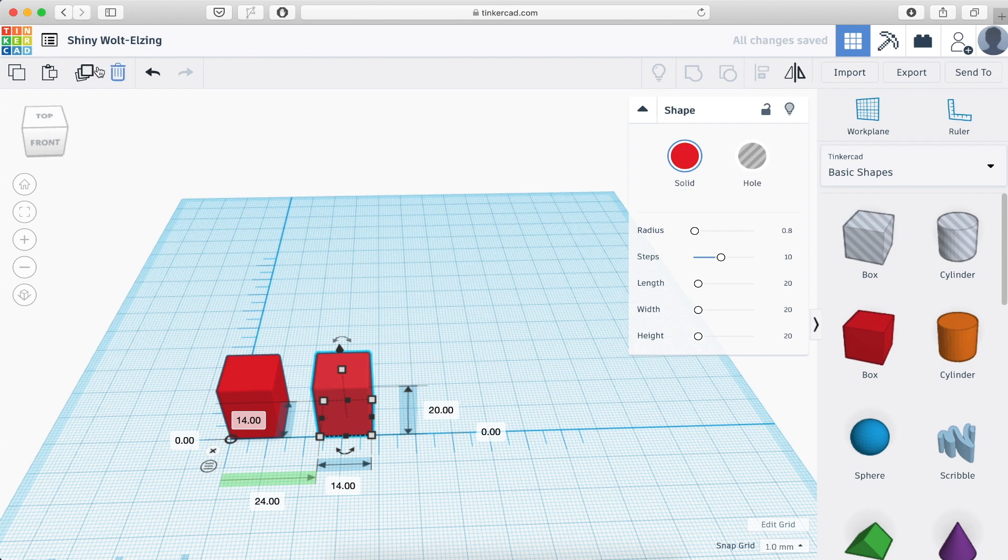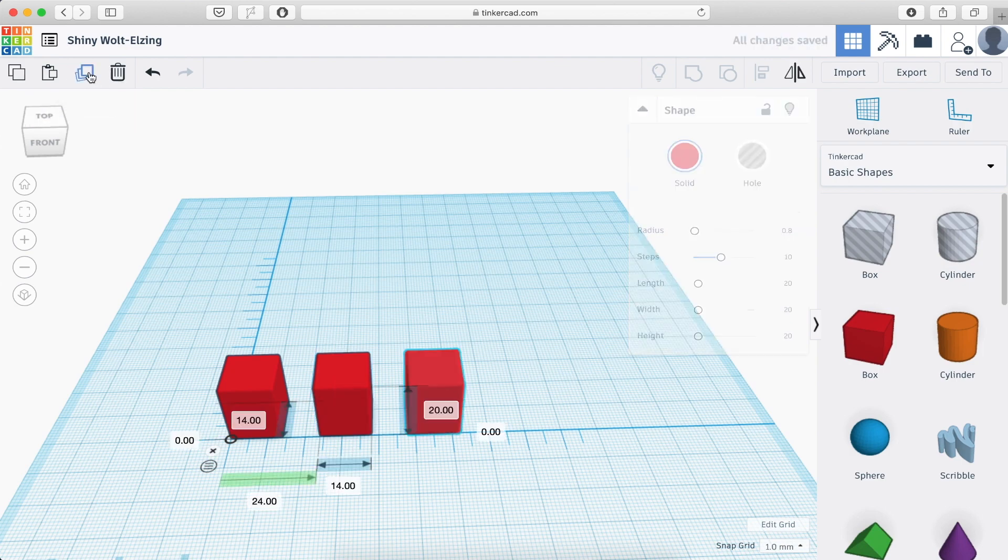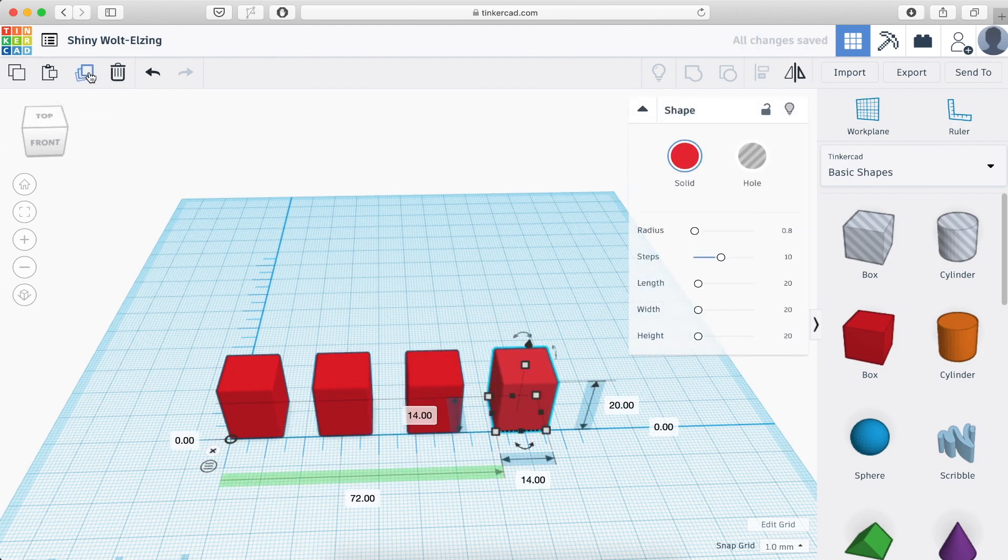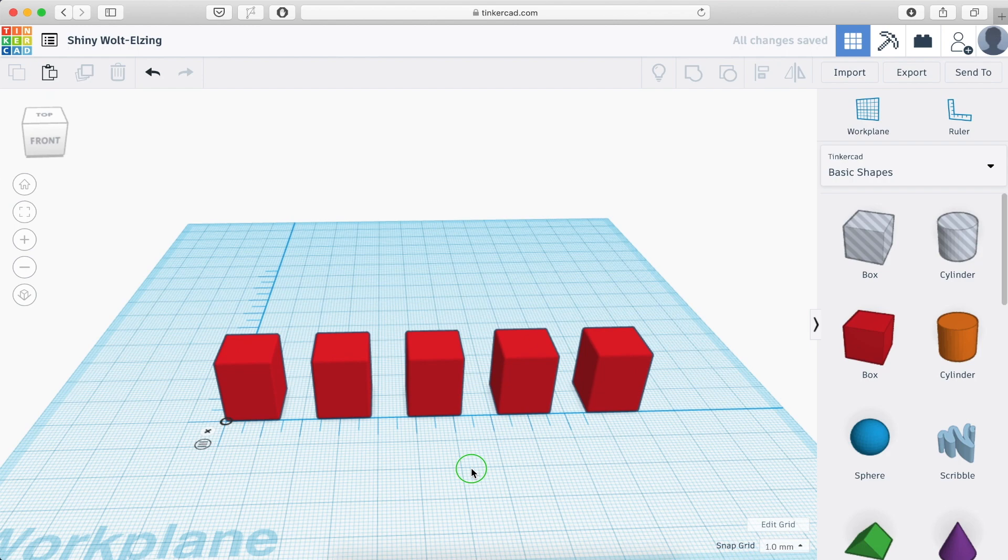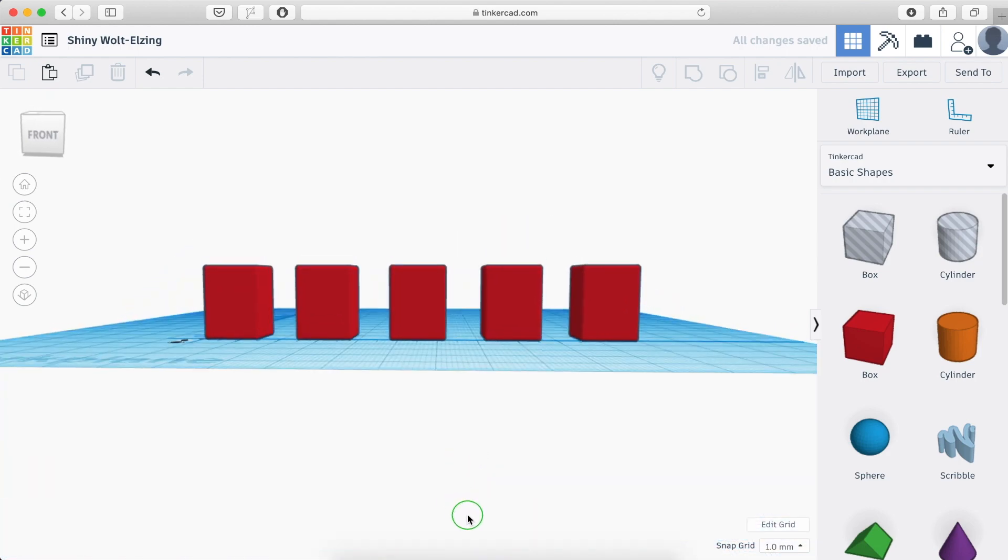Now if I keep pressing this button here, duplicate and repeat, it will keep the same distance. So one, two, three, and five. All right.